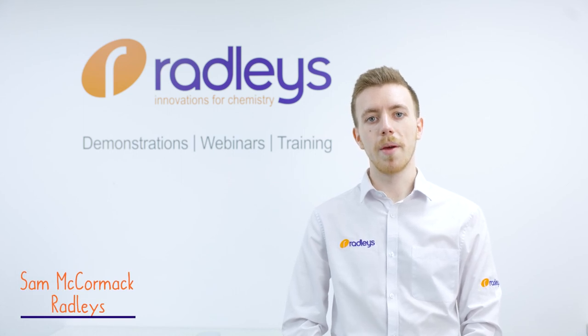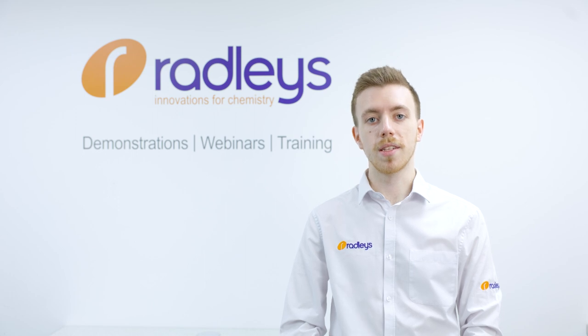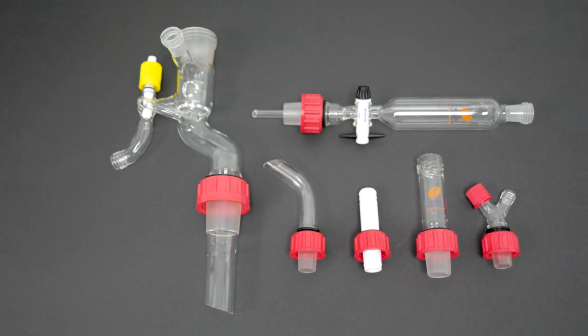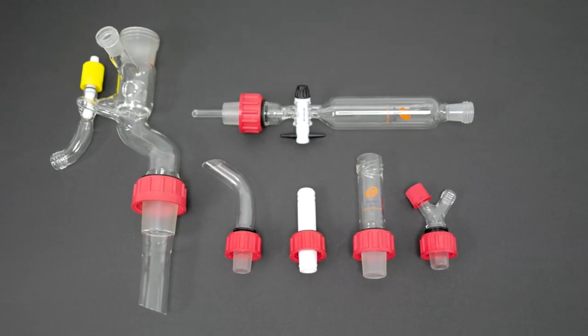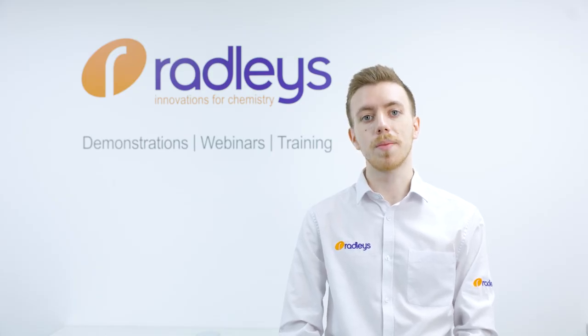Hi, I'm Sam, a member of the team here at Radley's, and in this video I'm going to discuss threaded glass joints versus standard ground glass joints. Rodevis joints are used on most of Radley's glassware, such as between Carousel 6 Plus flasks and reflux tubes.